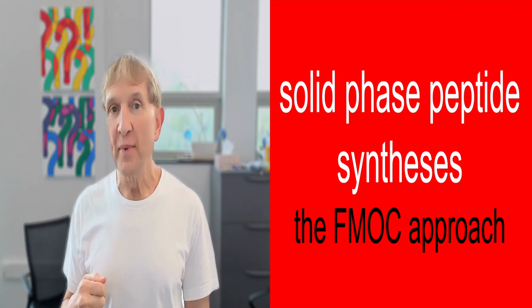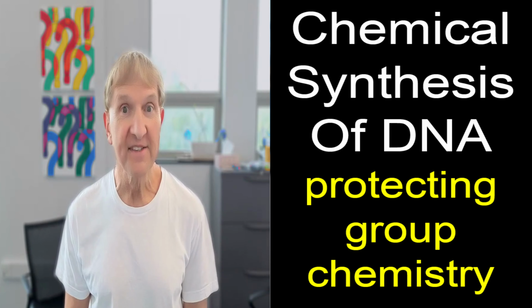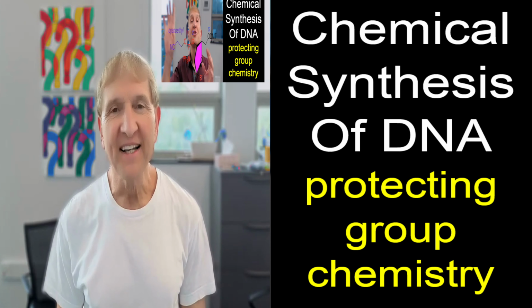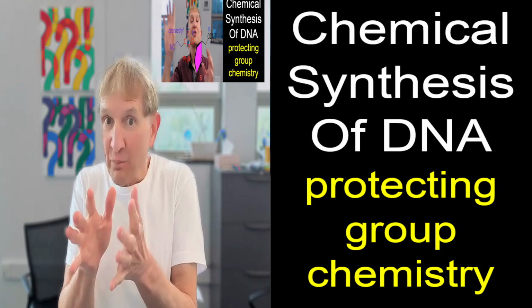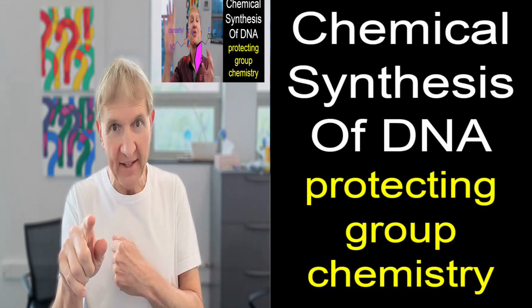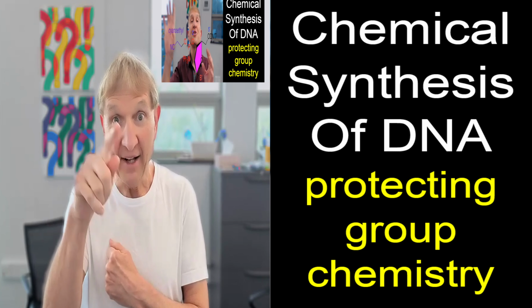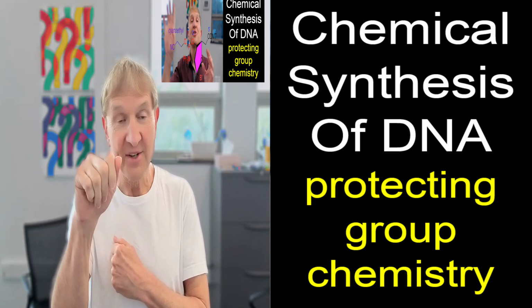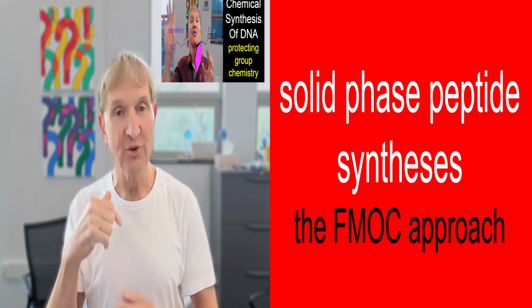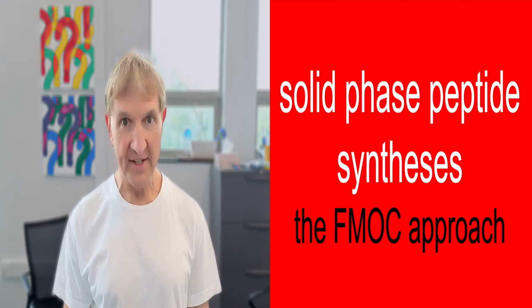I've already talked about solid phase syntheses of nucleotides in a previous video. And that's so refined that you can just program a computer, tell it exactly what sequence to make, hit start, and a machine will add reagents, let them react, wash away excess reagents, and keep cycling through the process. The same applies to peptide synthesis.